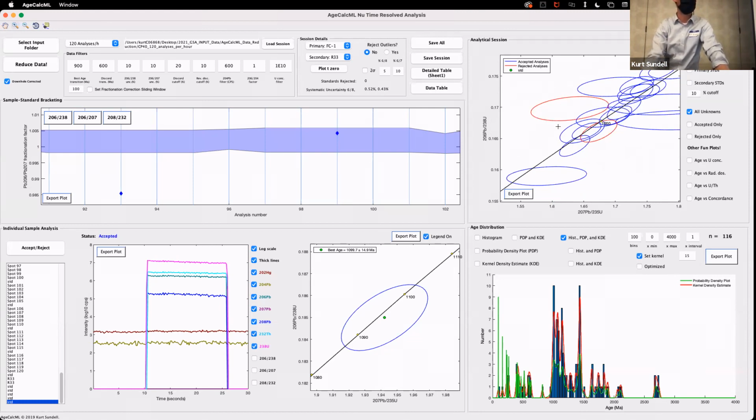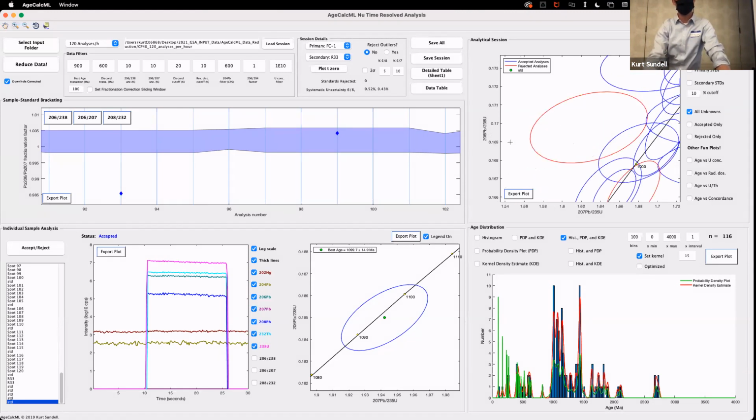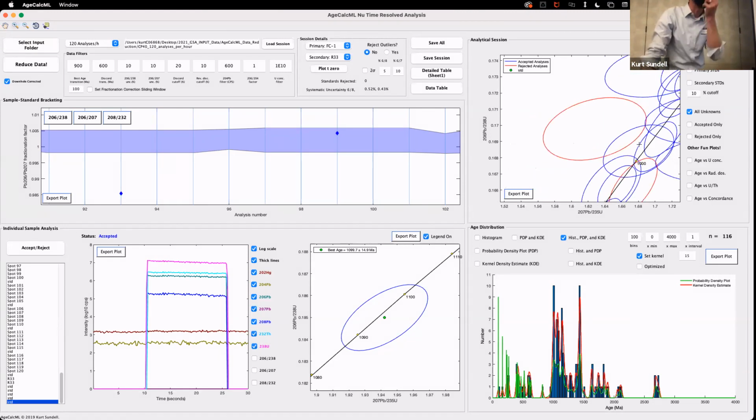It's pretty big, right? One thing you can do is, what if that was incorporated and accepted? You can start changing some of these filters. You can change that filter, hit re-reduce. It starts from a clean slate from raw data, and depending on what the scientific question is, you can refine your data set to fit that question and test what you're trying to test.